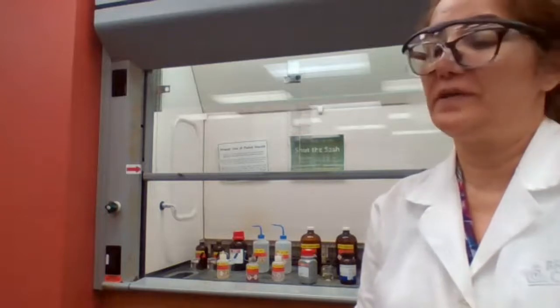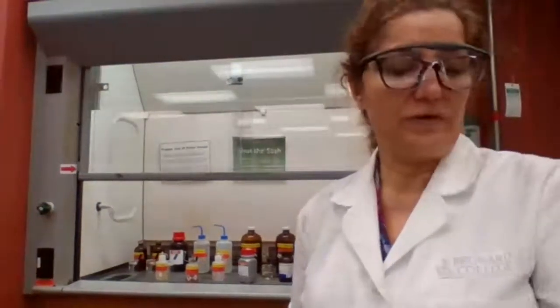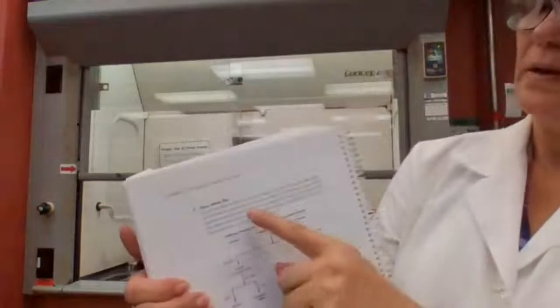Do you all know which part of the experiment we were doing right now? I repeated it at least like 5 times. Silver nitrate test. Yes, okay. And if you look at the procedure for silver nitrate with benzoic acid, very good.